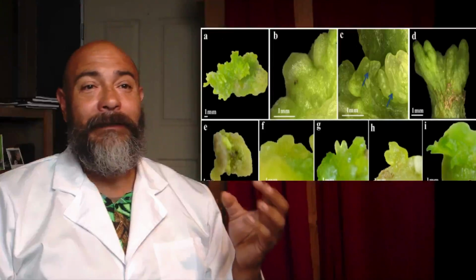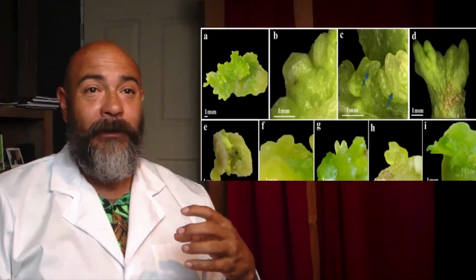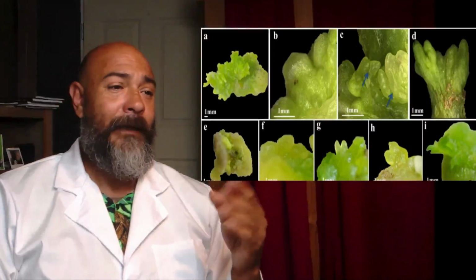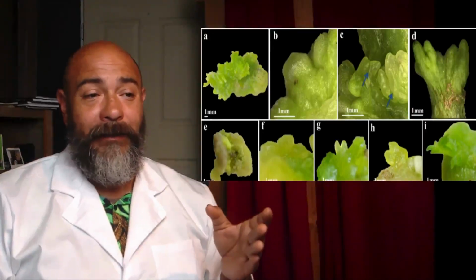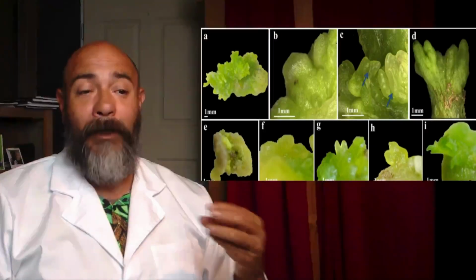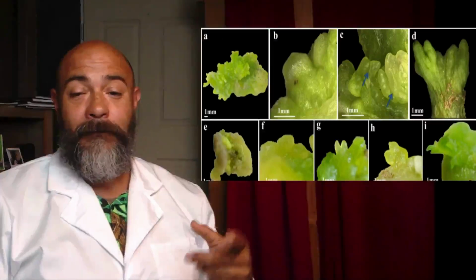And then in D, you're already seeing part of that heart formation. You're seeing it kind of spread off to where it's got two little lobes on it that very closely resemble hearts. And as it progresses, by the time you get down to G, you can see that those hearts are very pronounced, and they actually stick above the callus formation in photo H.